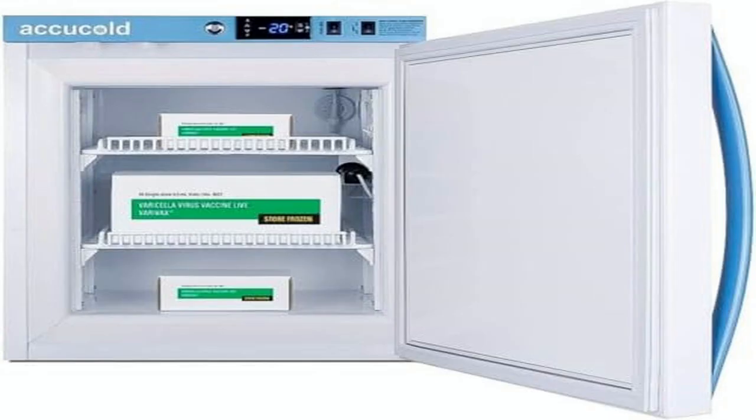On the downside, the compact size also caps the amount of inventory you can store. A 1.4 cu.ft compartment holds roughly a single stack of standard vaccine trays or a few dozen boxes of specimen vials. If your workload suddenly spikes, say, a flu clinic week or a surge in COVID-19 testing, you'll find yourself shuffling stock out to make room, which adds labor and risk.